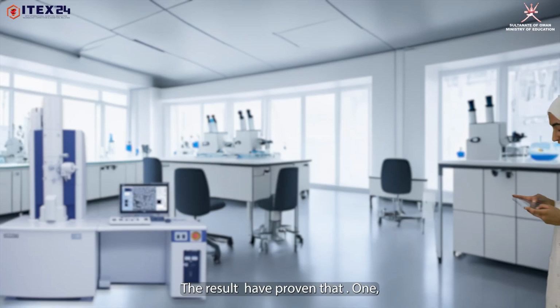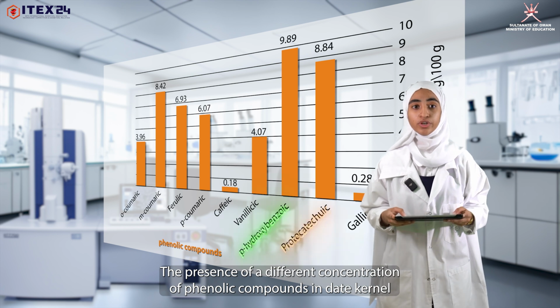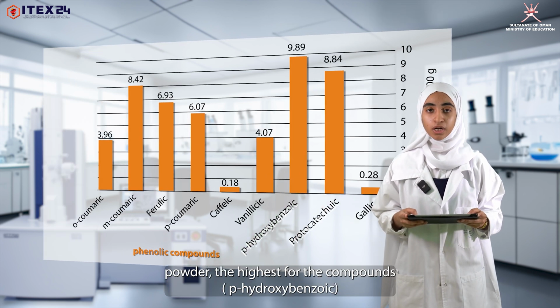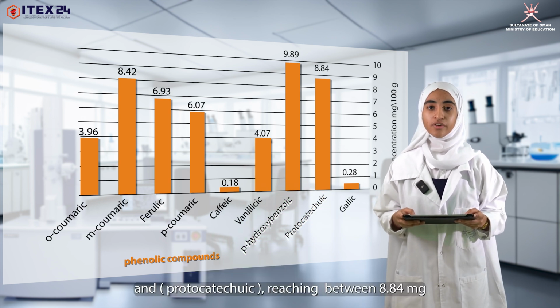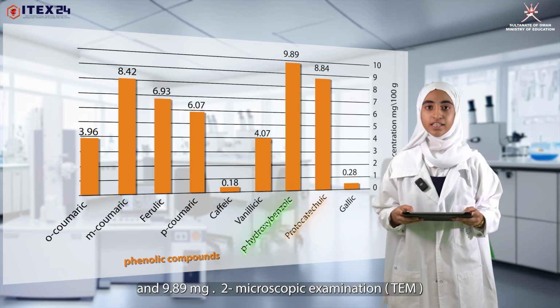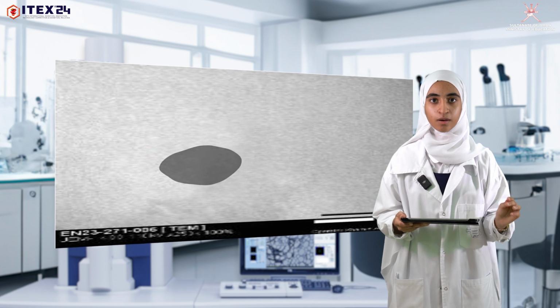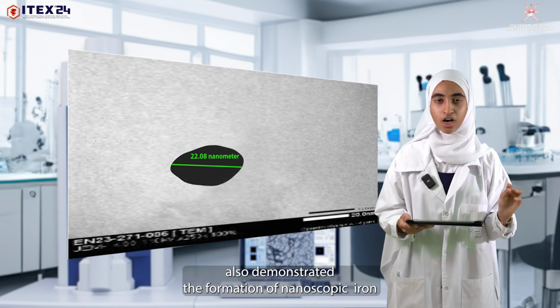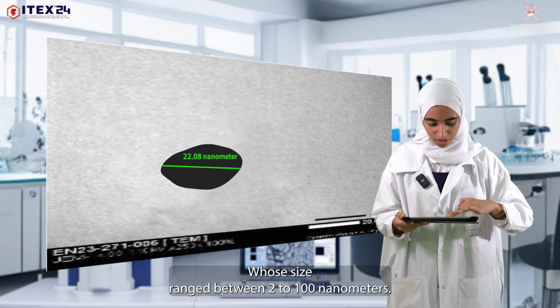The results have proven that: 1. The presence of different concentrations of phenolic compounds in date kernel powder, the highest being the compounds p-hydroxybenzoic and protocatechuic acid, ranging between 8.84 mg and 9.89 mg. 2. Microscopic examination by TEM also demonstrated the formation of nanoscopic iron samples whose size ranges between 2 to 100 nanometers.